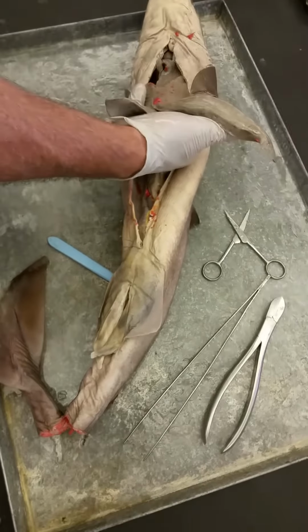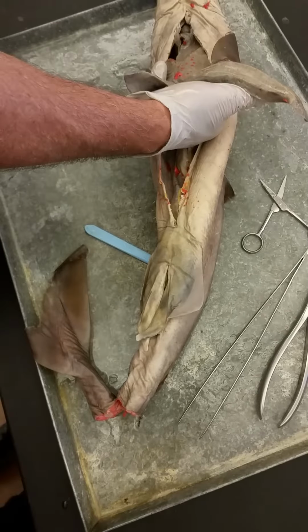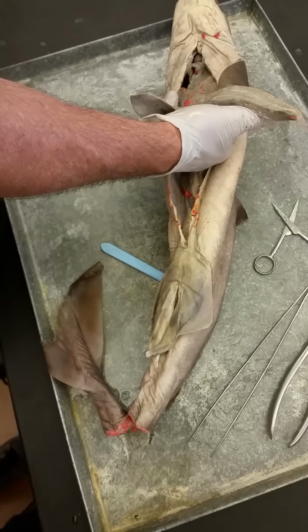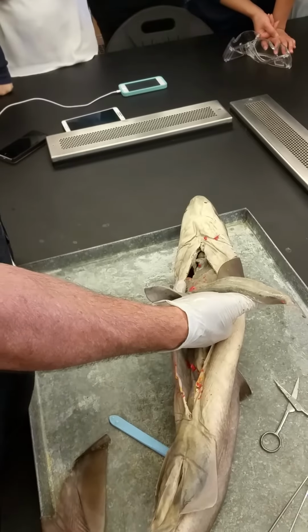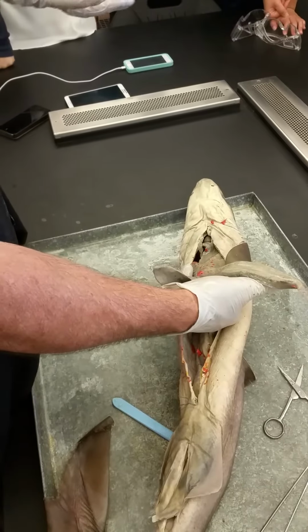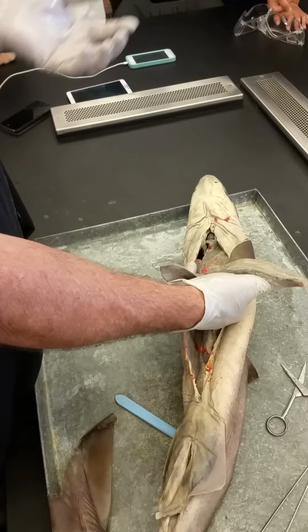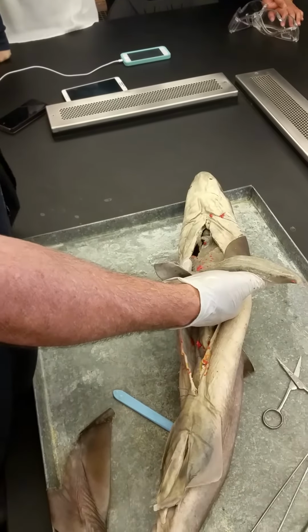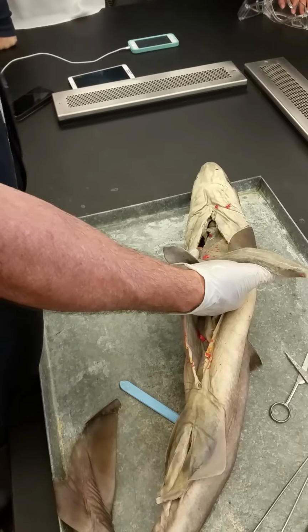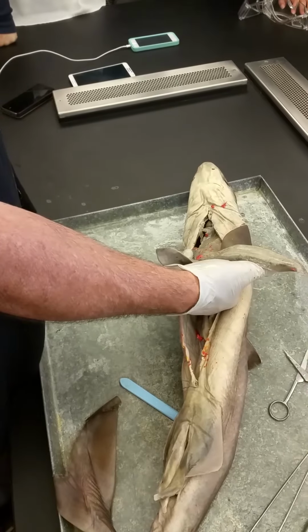So if you're a fish that changes depth a lot, or changes depth rapidly, the swim bladder is a problem, because if you try to come up too fast, it's going to overexpand, and it's like you holding your breath and coming to the surface. Your lungs overexpand. If you've ever seen anybody go rockfish fishing and pull up a rockfish from 100 feet down, all of a sudden its guts are bulging out its mouth by the time you get it to the surface, because it's overexpanded and blown out its internal organs.